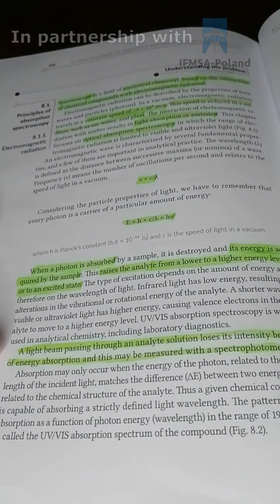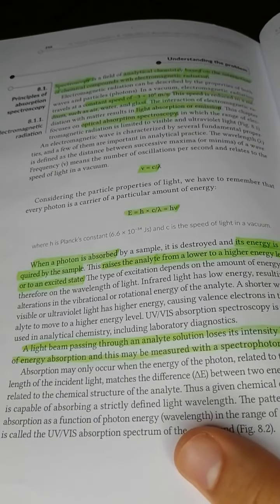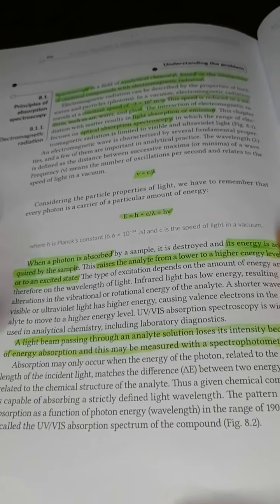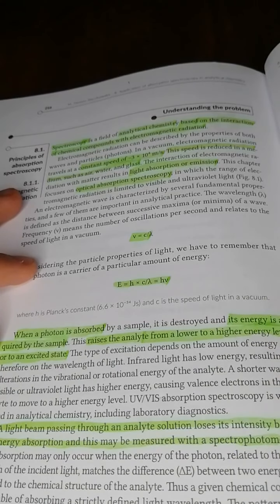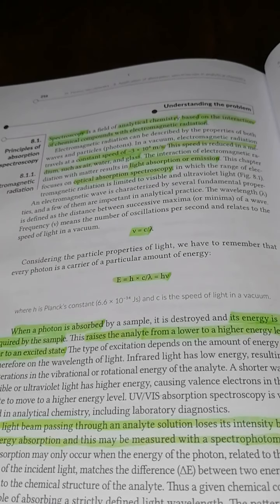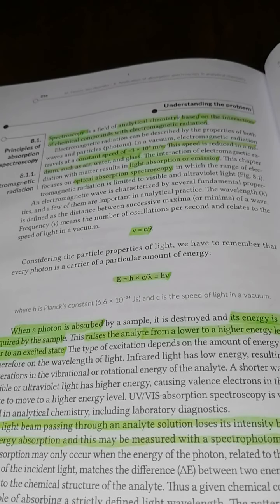Right. So last video was about electrophoresis and a specific type of electrophoresis. Today we're going to talk about absorption spectroscopy. Okay. So first of all, let's start with understanding what the concept really means.